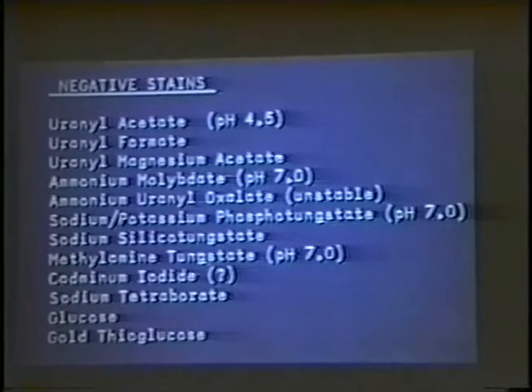Uranyl acetate also has a tendency to bind to negatively charged proteins and lipid phosphate groups. Indeed, in some cases, uranyl acetate produces gross and unacceptable protein aggregation. Uranyl acetate does, however, impart a superior contrast when compared to the other stains. But it has always been my opinion that one should try to use a range of different stains to image any one protein, since slightly different molecular features may well be revealed.